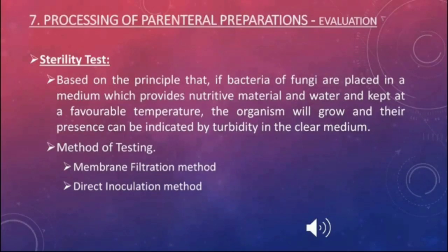Test for sterility may be carried out by first, membrane filtration method, second, direct inoculation method. Membrane filtration method involves the filtration of the sample under test through a membrane filter having a nominal porosity of 0.45 micron and a diameter of approximately 47 millimeter.